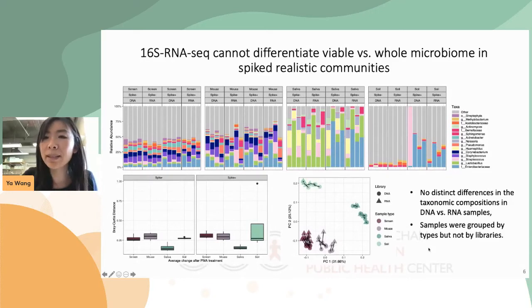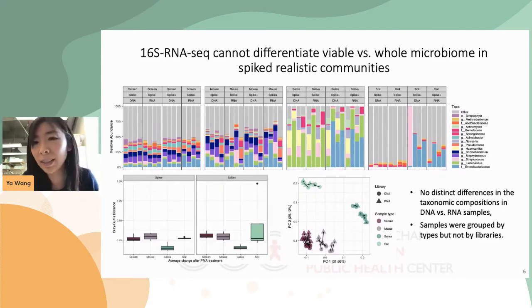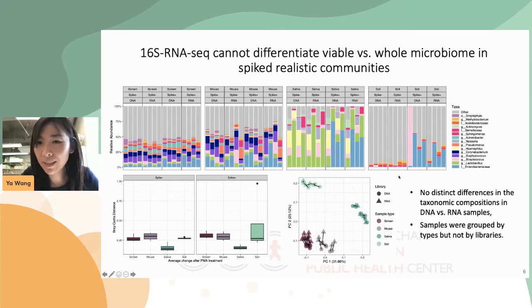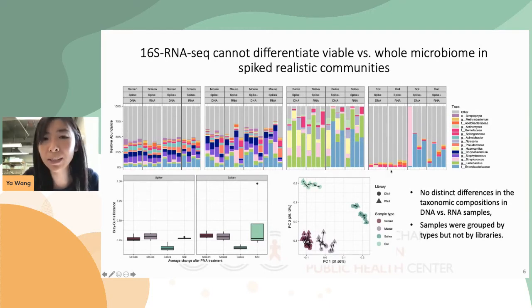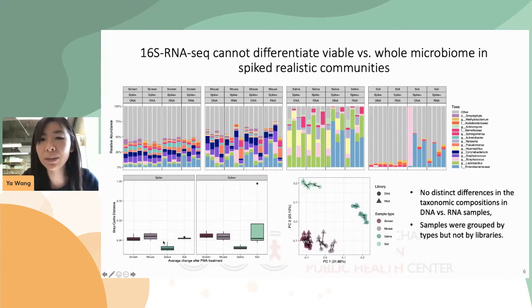However, when we applied this to pre-spiked community samples, 16S RNA-seq produced almost no differentiation between the DNA versus RNA libraries. The stack plot here shows the most abundant taxa across the sample types. As you can see, the RNA libraries look basically the same as the DNA ones, regardless of sample type or whether they were spiked or not. The Bray-Curtis dissimilarities between DNA and RNA libraries were very low, and samples clustered by sample type in principal coordinate analysis, not by library type.